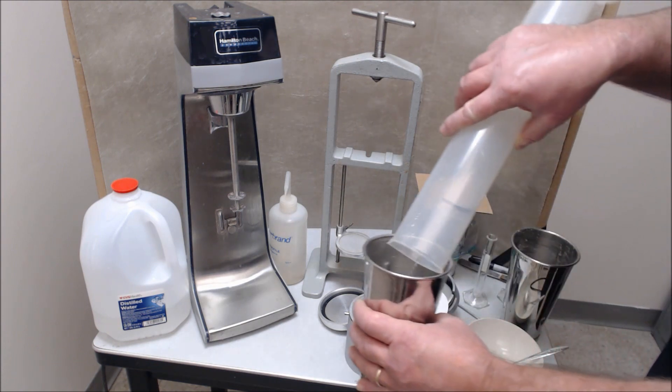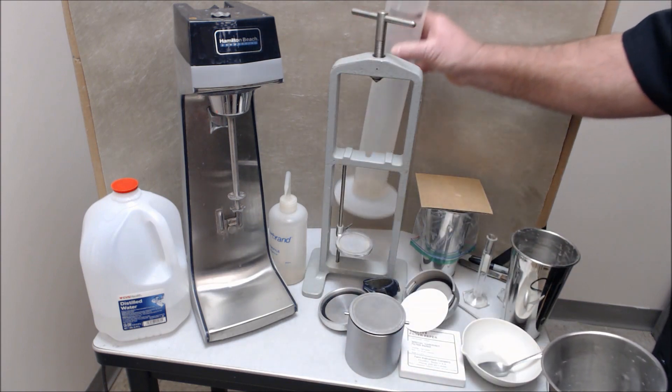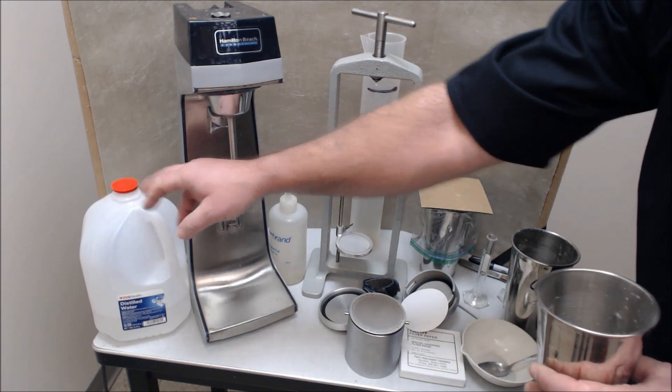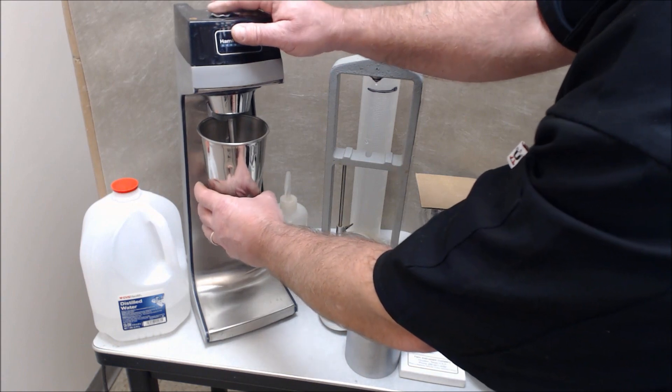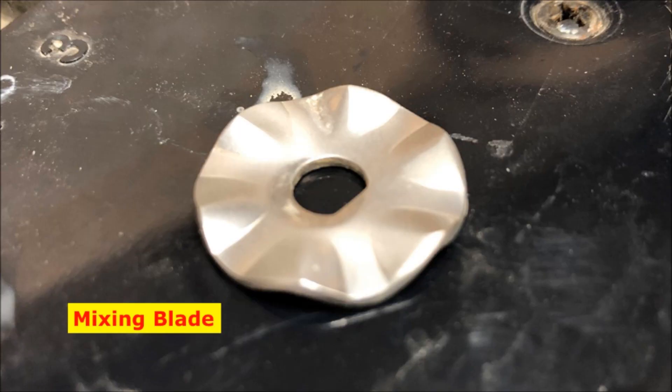You do that by adding 350 milliliters of distilled deionized water. It has to be reagent grade water so this has to be very clean. You then introduce this into a mixer and it looks a lot like a milkshake mixer. This is a Hamilton Beach. It needs a wavy blade like this.